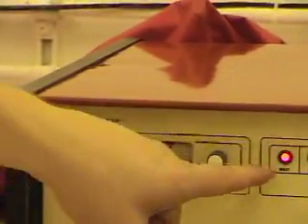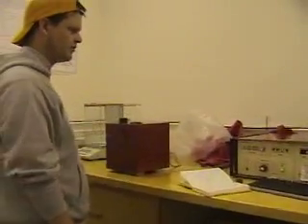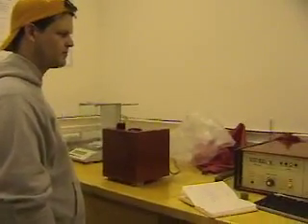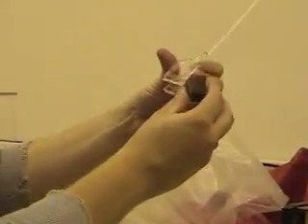We let the machine calibrate itself until it says ready. According to the rules when working with this on low settings, we don't want to have a belt, wallet, or even pennies waved around, as they can disrupt the readings. So first we're going to go ahead and calibrate our sample holder. Once it says ready, we click measure and drop in the sample holder. We recorded our sample holder reading and value, so now we're going to measure our sample. We load up the sample — in this case with cubes, my primary arrow here is in dashes — and I'm going to put that in the sample holder.